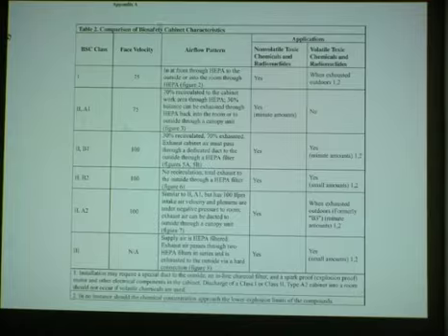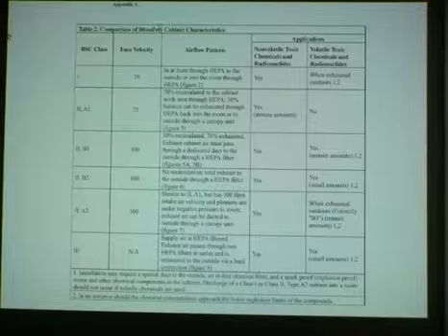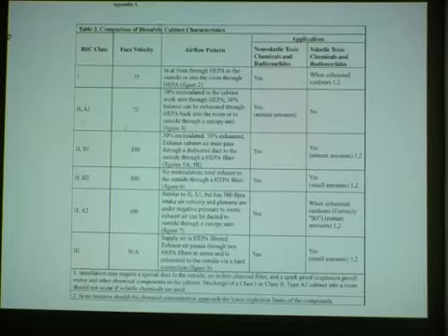Now, as I have been repeatedly saying, biosafety cabinets should not be used for work with aggressive chemicals. The materials of construction are not appropriate, not designed to withstand aggressive chemicals. In type 2 A1, the face velocity is 75, 70% is recirculated, 30% is exhausted, either back into the room or outside, but never hard ducted. You can use the thimble unit or the canopy unit with a 1-inch gap between the exhaust filter and the intake area of the canopy.